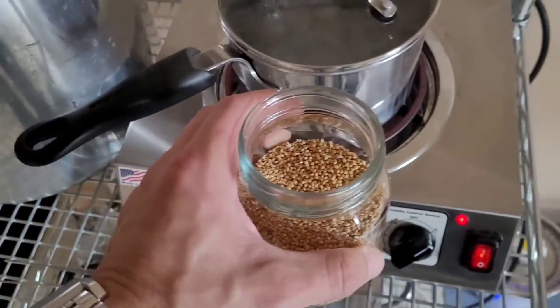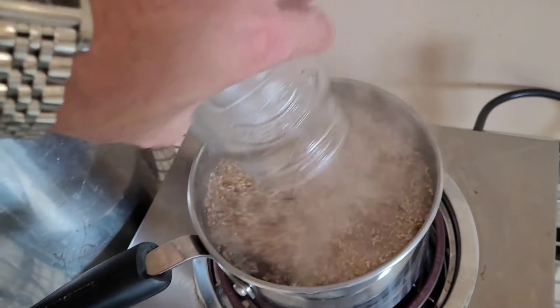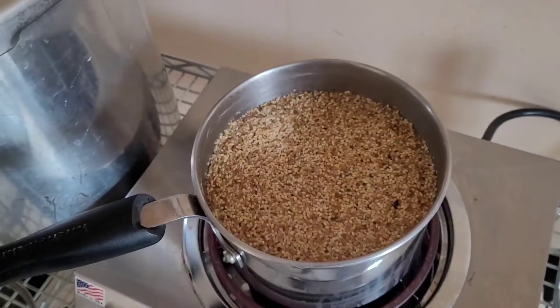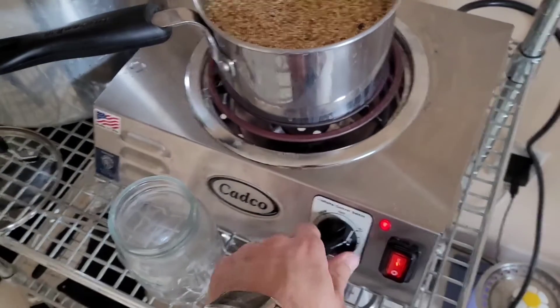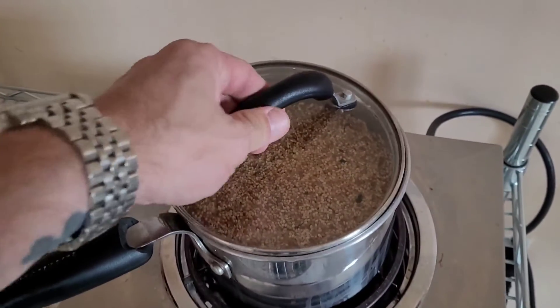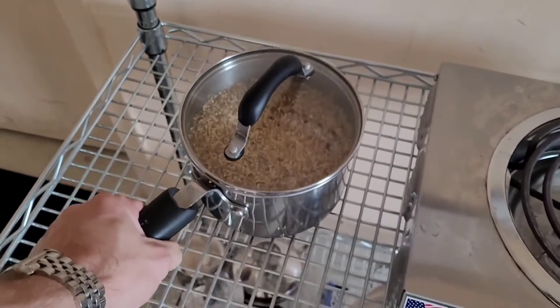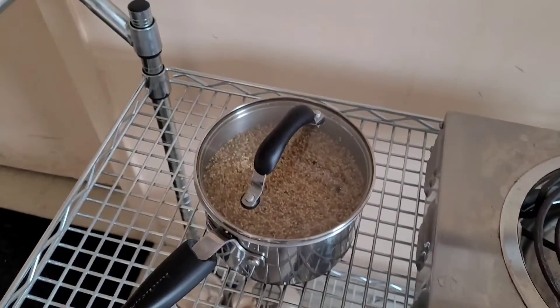Water's boiled, time to flash prep some millet. That's it for half an hour and then load it up.